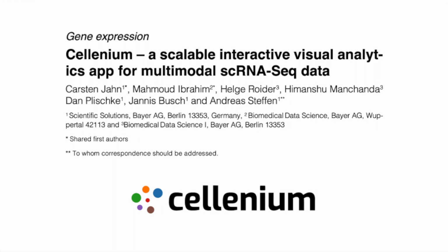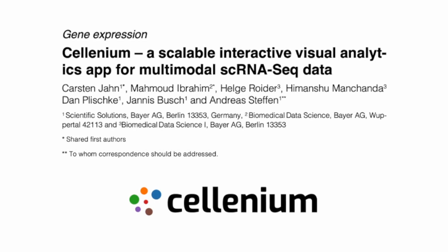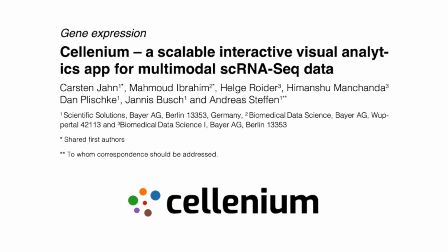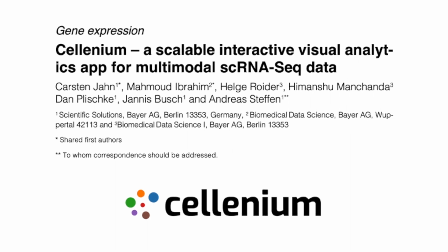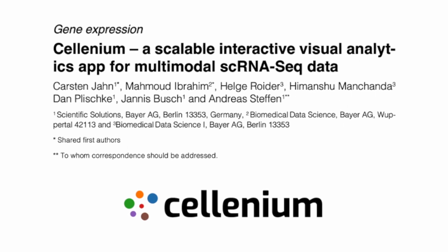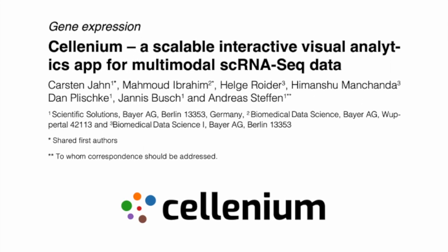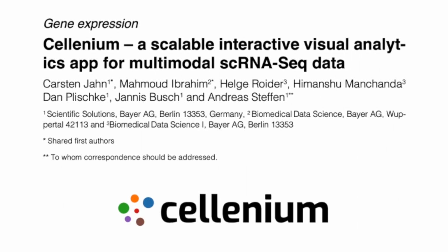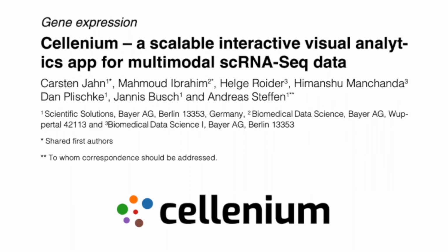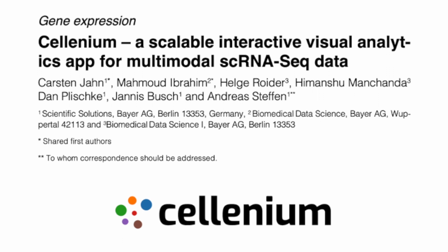Welcome to the screencast, where we will be demonstrating Cellenium, our platform for collecting and analyzing single-cell sequencing data, including scRNA-seq, CITE-seq, and ATAC-seq data. Our primary goal for Cellenium was to provide users with a high user experience, fast responses to user requests, scalability in hosting a large number of studies, system simplicity leading to small maintenance effort, and low runtime costs. Our internal installation hosts approximately 600 studies from both internal and external sources.